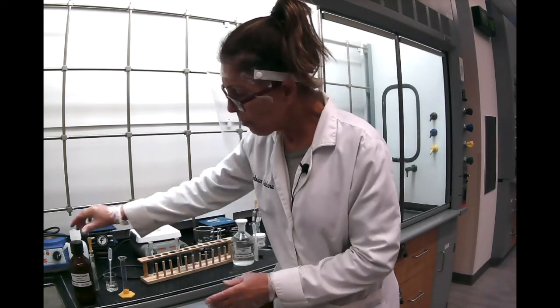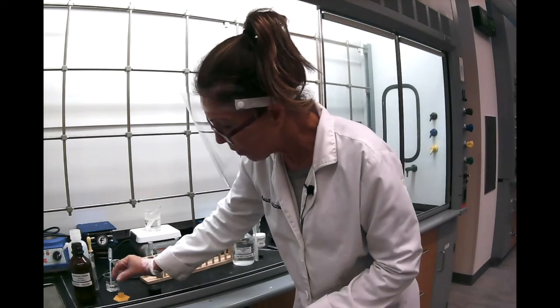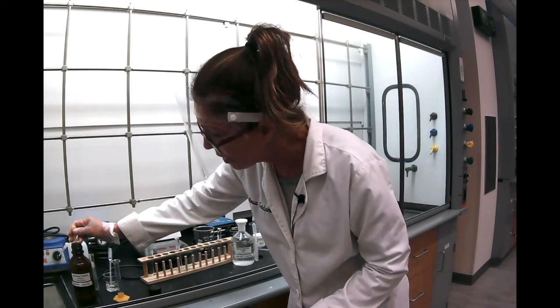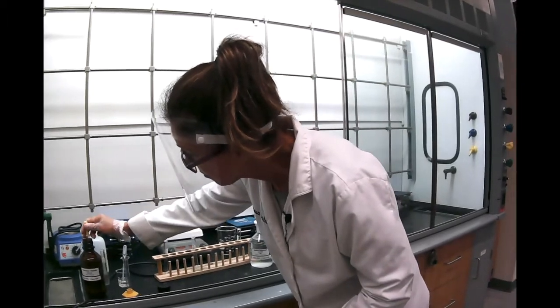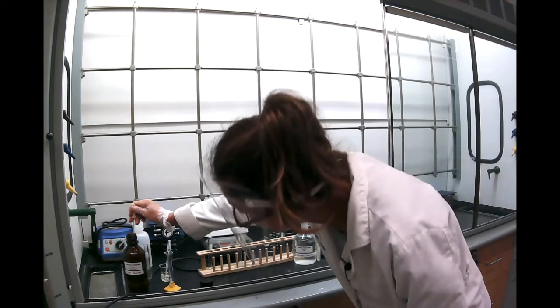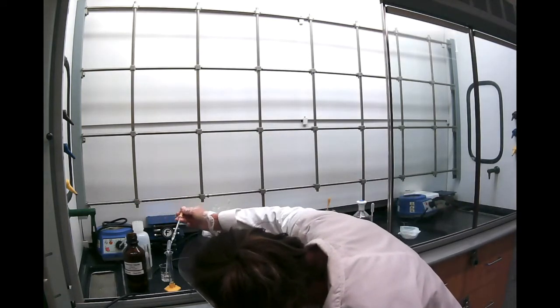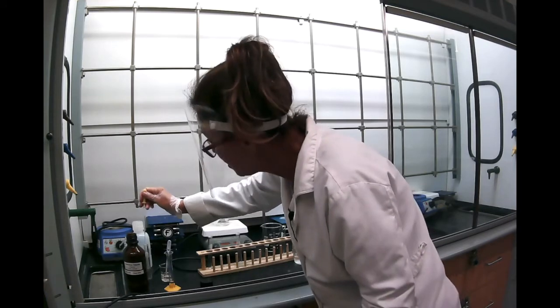So first step, we're going to add 2 milliliters of the methylene chloride, like we did earlier. Just measure 2 milliliters. So I'm roughly there. Okay, so this is 2 milliliters.